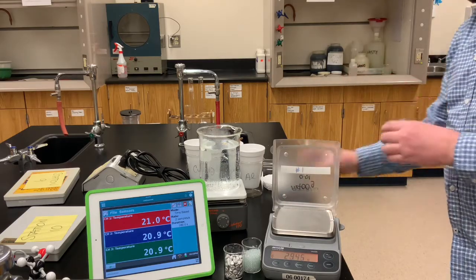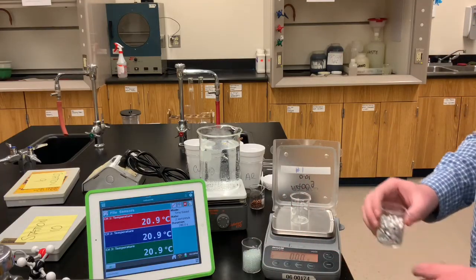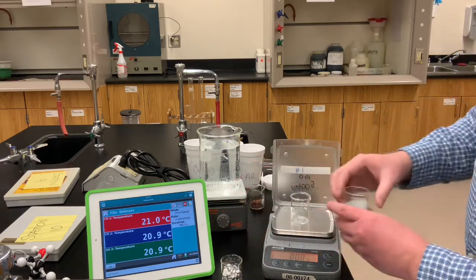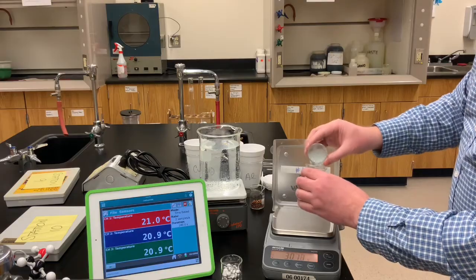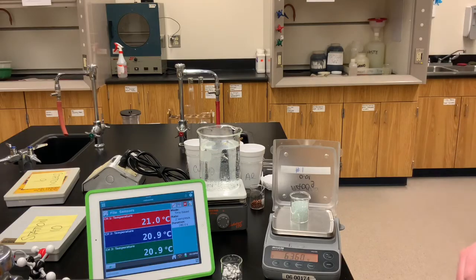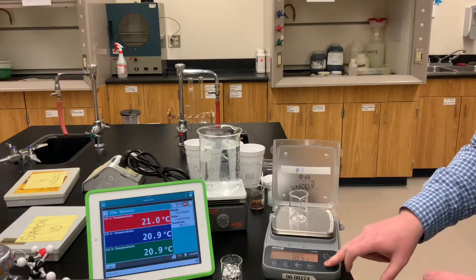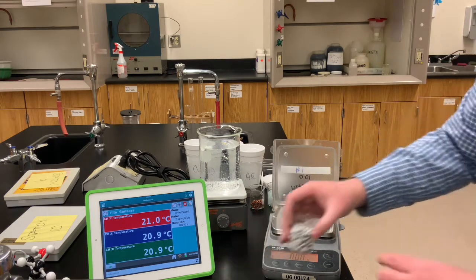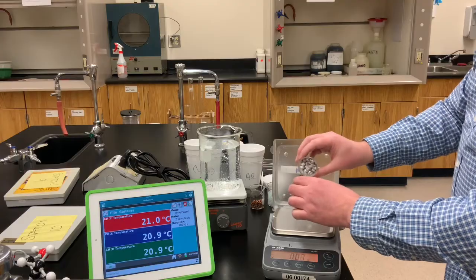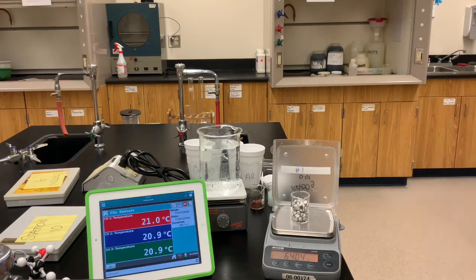We'll do the same thing with another beaker — zero it. The glass beads will be next, so we'll pour glass beads in and you can record for yourself the mass of the glass beads we're using. Then zero the balance again and figure out the mass of the aluminum shot. The aluminum shot is much larger pieces — record that mass for the experiment.